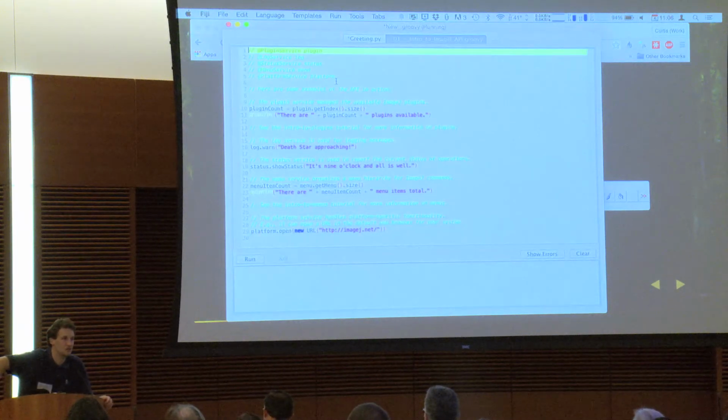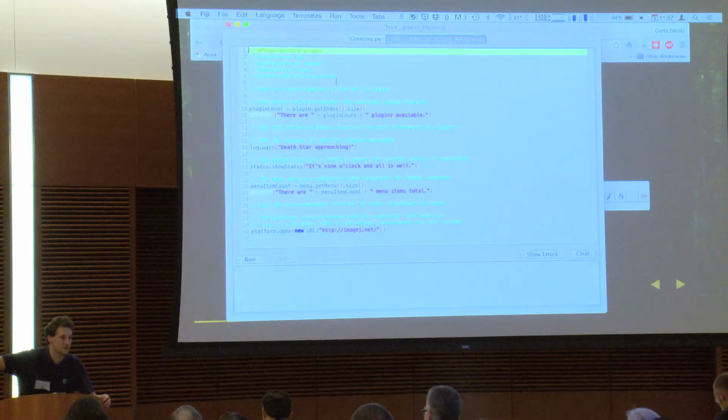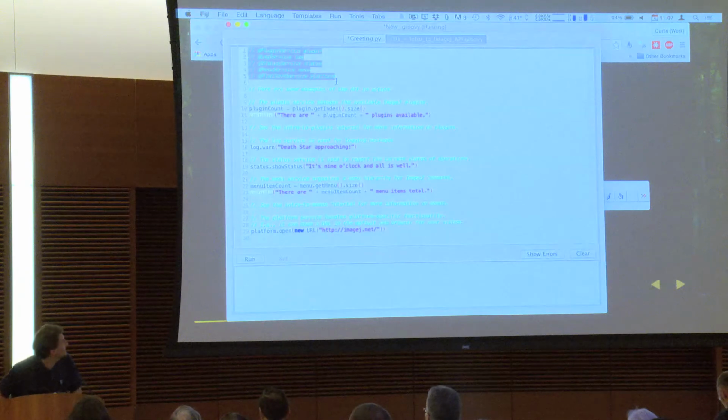Not like a system service. This is a software architecture term. If you're familiar with application contexts, like the Spring library does this in Java, I'm sure there's a Python equivalent or many application context-based things. Basically SciJava Common, that library that we built ImageJ2 on, is an application container and plugin framework, and it's all service-driven. So it's nice because you can limit which services are available to use less memory, if some of them are expensive. But here are some of the basic ones that are built into SciJava, and there are some examples here.